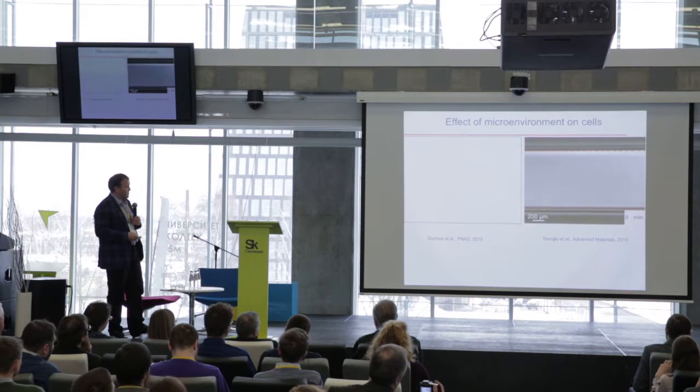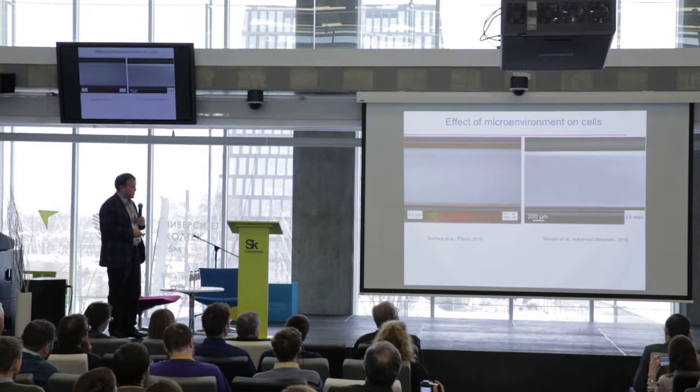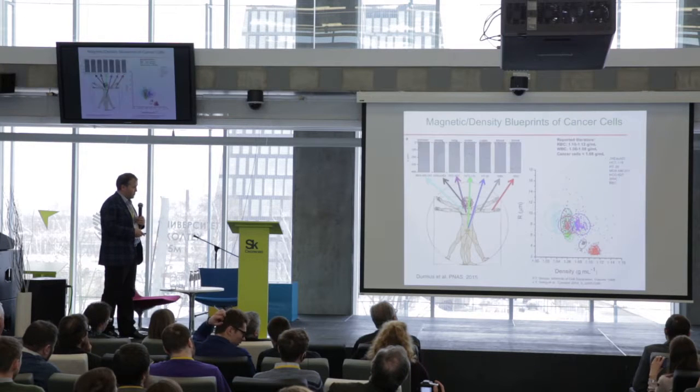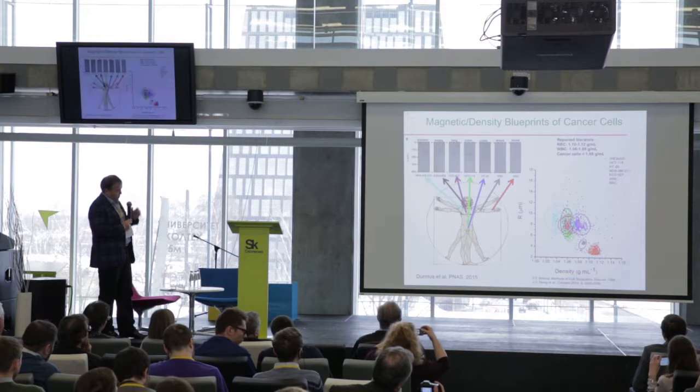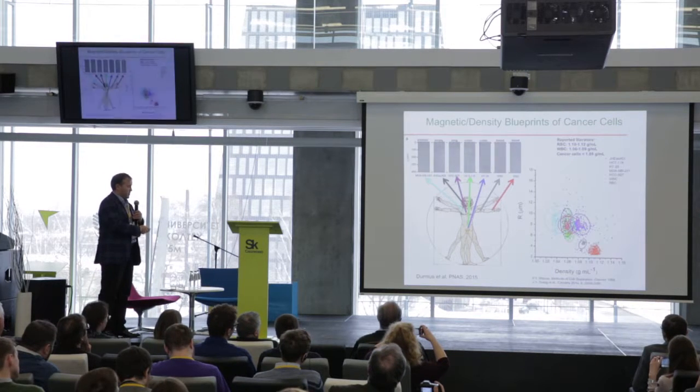So what we do is, I'll just play this quickly. You've seen this video before, but this is a real-time demonstration of how long it really takes to stabilize cells in this system. And we are able to actually, within less than 20 minutes, create cell bands in a capillary format. What we learned was also from investigating this further with cancer cells and blood cells, and these are mainly cancer cell lines.